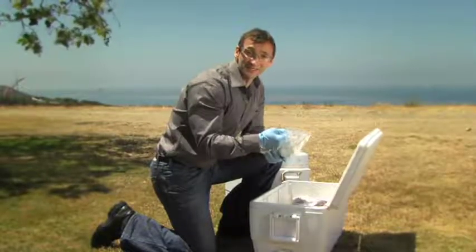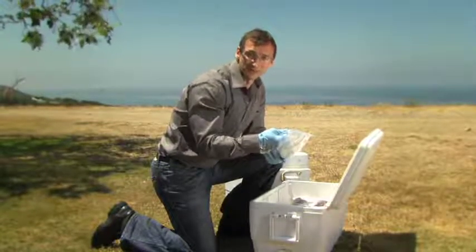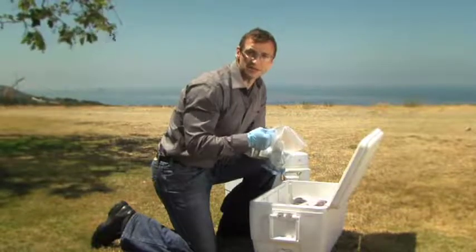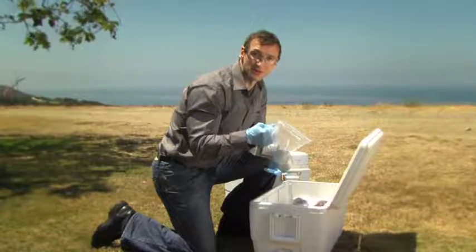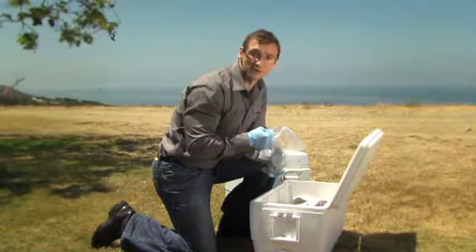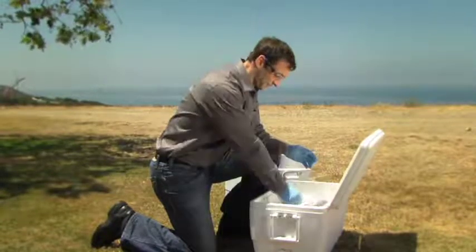We collected, sieved, and homogenized them in the field. The sieving and homogenization procedures were specified in our field sampling plan, which was reviewed and concurred with by the appropriate regulatory agencies for this project.